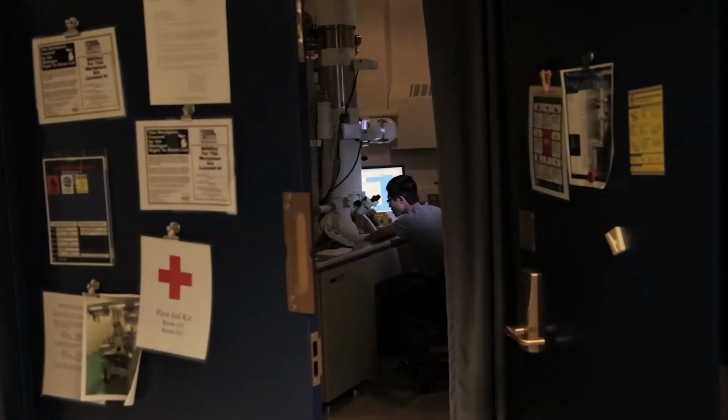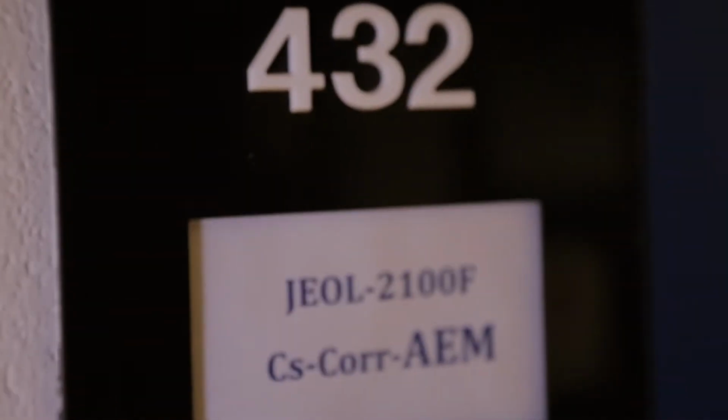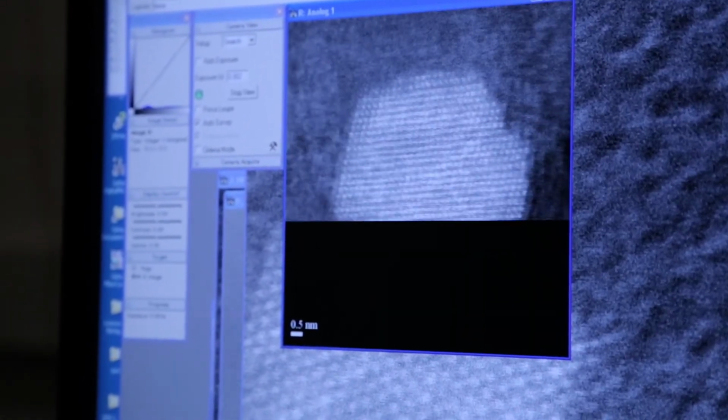Well, actually, I've always been sort of a seeing-is-believing type person, so when I was growing up, we always talked about how the atom was the smallest possible bit of matter, but I'd never really seen an atom, so I wasn't so sure they existed. But now with the new CS-corrected STEM, we can actually get direct imaging of the atoms, and I can say, yes, I've seen atoms, which makes me one of very few people in the world that has.